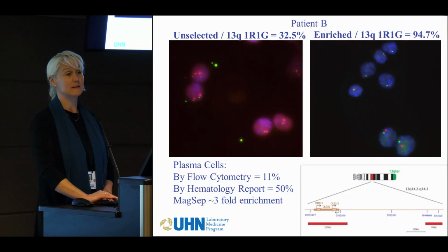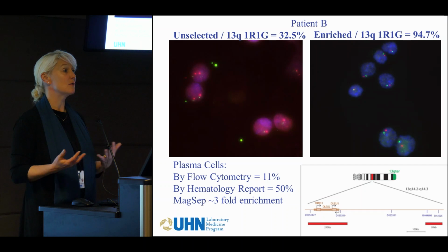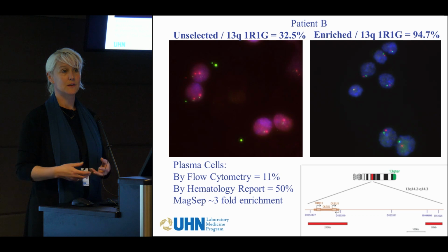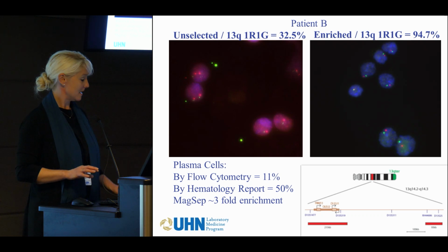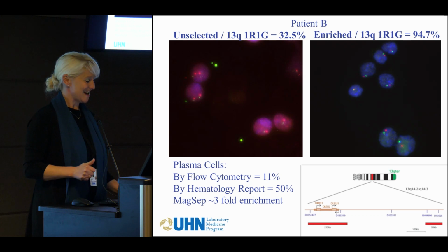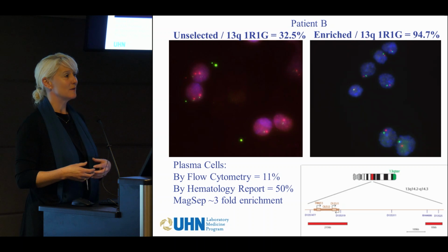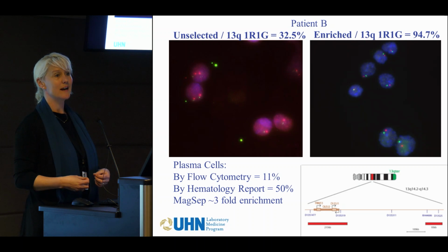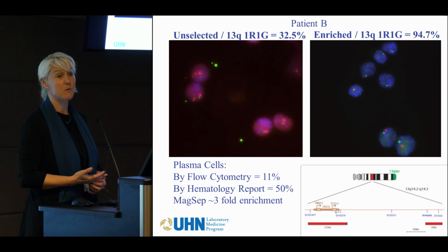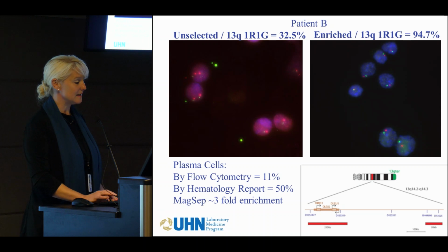And here's just some examples. We found with our cells going through a column, I don't know if any of you work with purifying samples like through a column. 15? Okay, thanks. But if you purify your sample, you get rid of a lot of debris and background, and it substantially improved the quality of our analysis. So that was exciting to see.